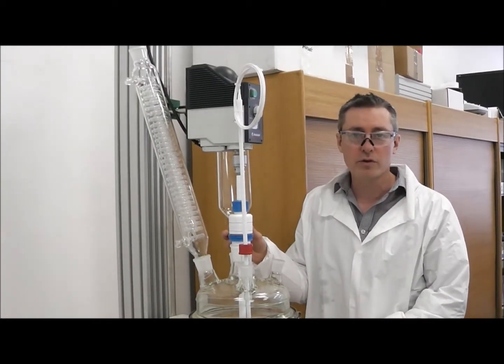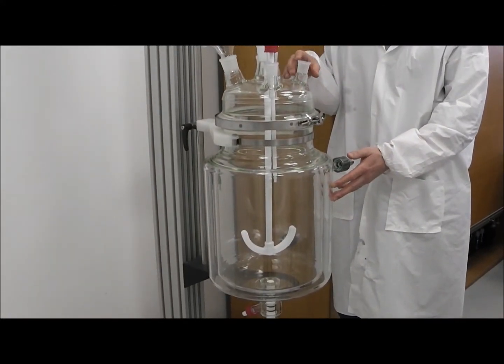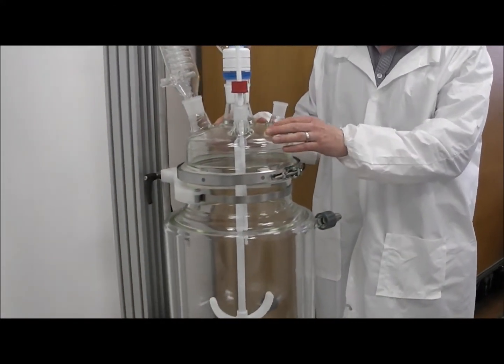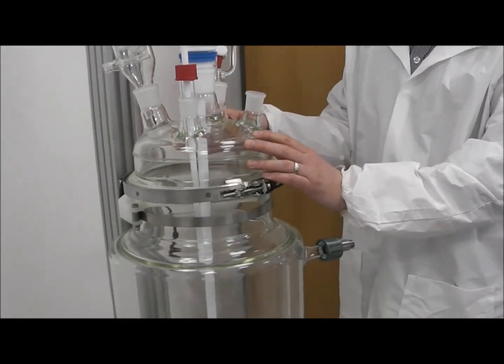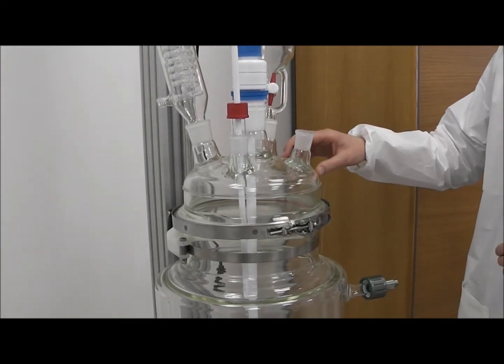We're going to do a quick overview of the Glass Solutions Jacketed Reactor. This one happens to be a 15 litre reactor with a lid. The lid has standard fittings — you can have B24, B19, B29, B32. It's whatever you actually want.